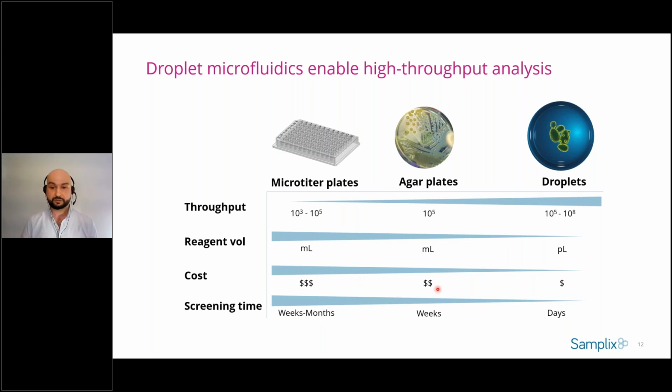Contrary to that, droplet microfluidics allows a substantial miniaturization and parallelization of the assay. The assay and single cells can be compartmentalized into thousands of picoliter droplets per second. This increases the throughput, allowing researchers to explore larger experimental landscapes while also reducing the costs per assay.